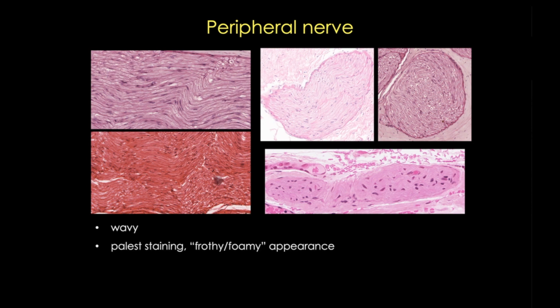When we section peripheral nerve, we see waves and sometimes even white spaces between the bundles. Peripheral nerve is almost always the palest staining of the three tissues, and it has a frothy, almost foamy appearance. This is because myelin, which is mostly fat, and axoplasm, which is mostly water, don't stain well with common stains, and also because myelin can be removed by the fixation process, leaving almost clear spaces. Peripheral nerve sections show numerous nuclei, but remember the visible nuclei mostly belong to Schwann cells. These are external nuclei — they lie alongside the associated fibers, not within them.